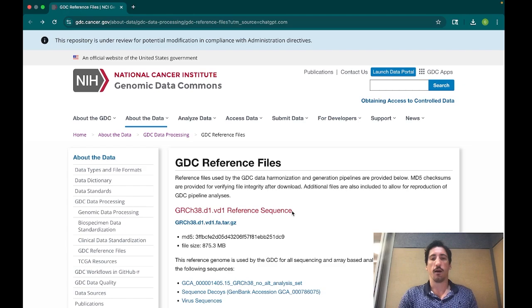And so this is me still making a mistake on this, but I just wanted to re-emphasize when doing any sort of sequencing analysis, the reference file and version has to be the exact same throughout every single step of the analysis process. So I went back and found, okay, which reference file did GDC use to align these tumor-normal whole genome sequences? And we found that they were using the specific GRCh38 reference version. And so we're going to have to download this file, move it onto the S3, and then move that onto our AWS instance, and then we're going to have to do some indexing.